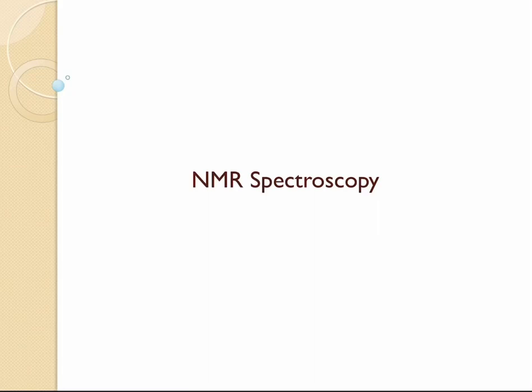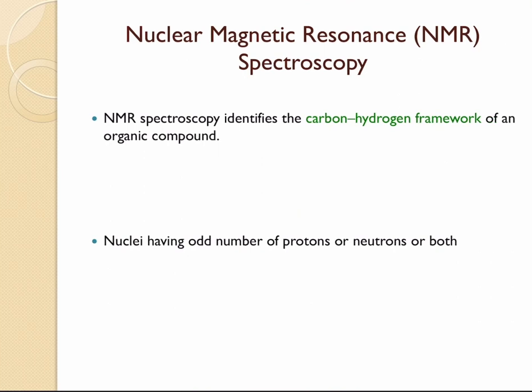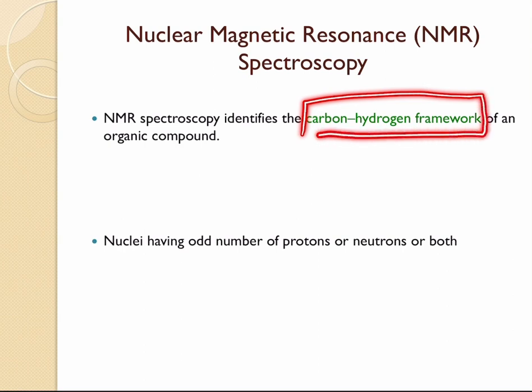NMR spectroscopy. This video is on the introduction to NMR spectroscopy. NMR spectroscopy is one of the powerful spectroscopic techniques used in the structural elucidation of organic compounds. It mainly identifies the carbon-hydrogen framework of organic compounds.